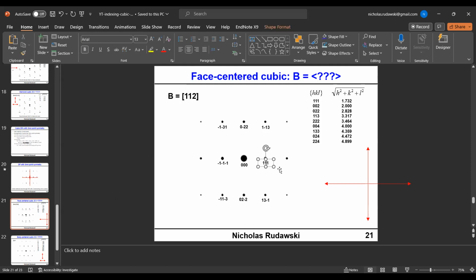Okay, so then let's rearrange this one to be, if we do 1, 1, 1 bar, that gives me a 0 dot product, okay, with B and G1. So then if I do B cross G1, I end up with this answer here. Let me delete the rest of these here. Well, I won't delete these yet, sorry. All right, so let me go back here.